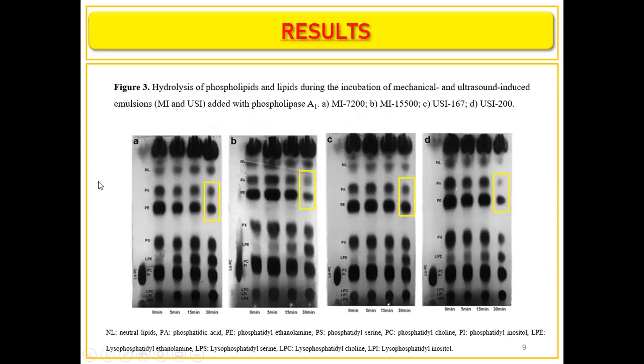I'm showing you that clear difference, where phosphatidic acid and phosphatidyl ethanolamine are hydrolyzed over time. We see a clear diminishment of the bands in all treatments.